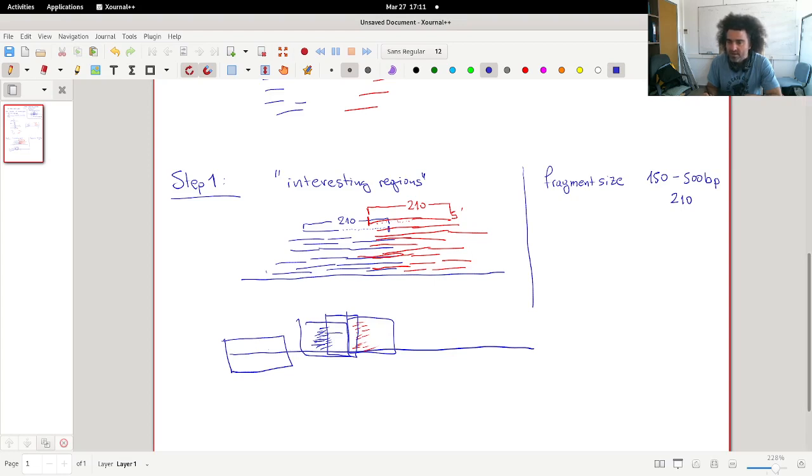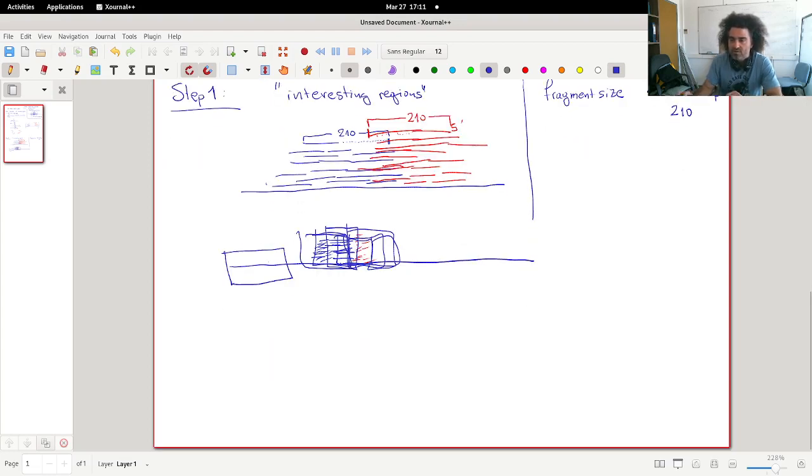But by extending the reads here in the middle and having from both sides higher depth here, then as long as we are here, we will catch this one, and then here we will catch, because we'll get this middle region here and here and here and so on. Okay, so we have extended the reads, and now we don't have this bimodal distribution any longer, but what we have is, I will just use one color now, regions like that.